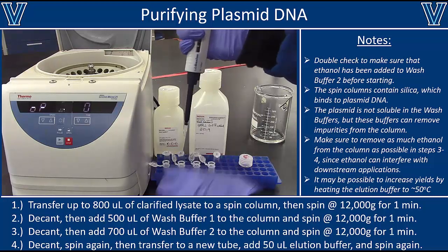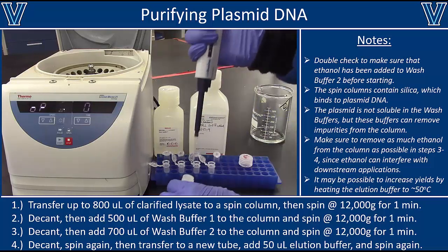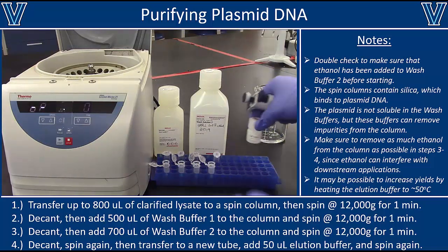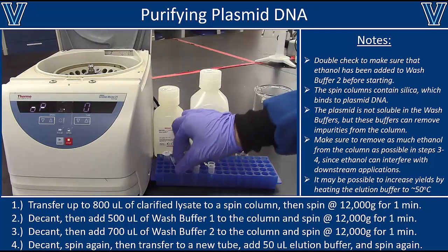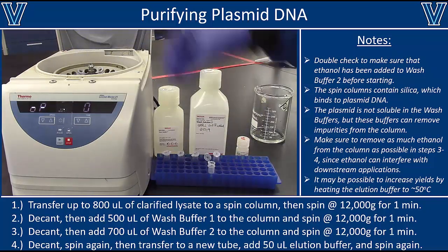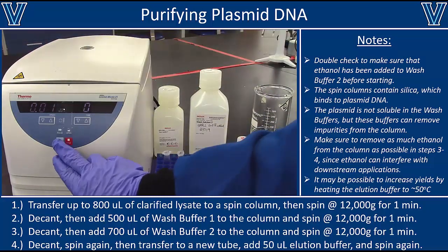Don't add it to the side of the tube because it needs to be in the resin to strip the DNA from the tube. Now, one thing that can help you get slightly higher yields here would be if you preheated that elution solution to 50 to 60 degrees Celsius. You might actually strip more DNA off the column than if the elution solution were at room temperature. If you can't find the elution solution, ultra pure water also works for this step.